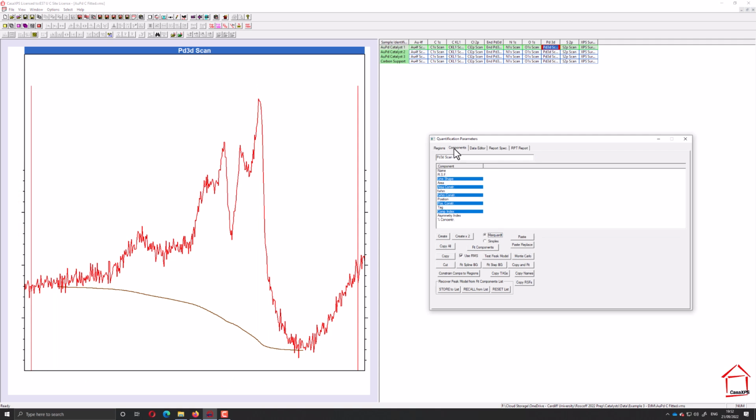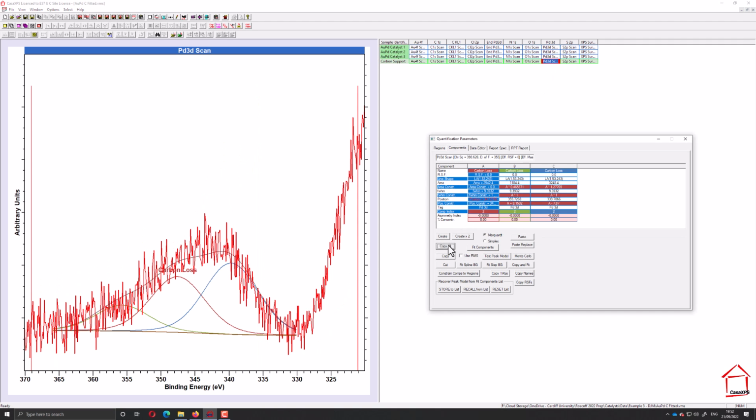And what we're just going to do is copy all that, and what I should have mentioned is I've taken this first peak. I could take any of them really, but I've taken this peak which was put in first, fix this position because we're assuming these don't shift, and put everything relative to that peak.